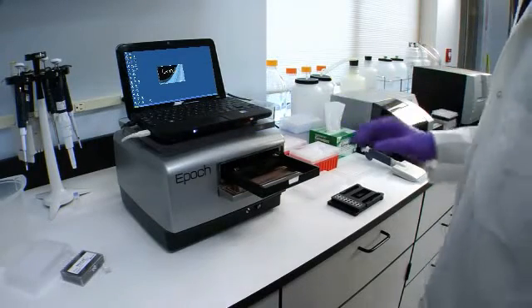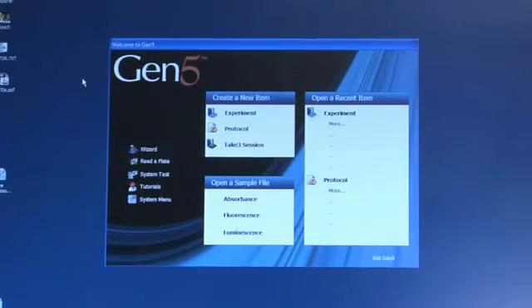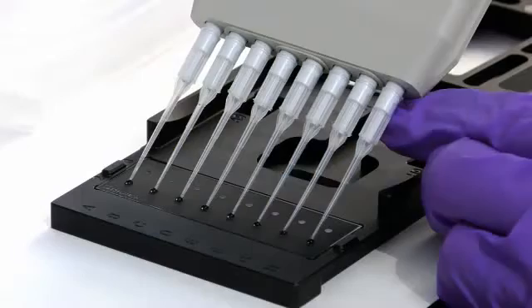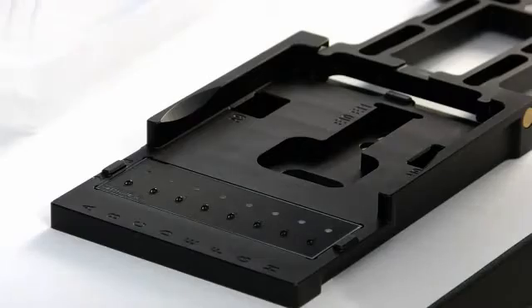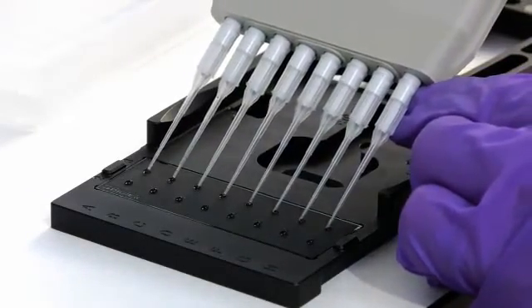Pre-programmed protocols in the Gen 5 software make it simple to choose the sample type and quickly obtain and calculate data from the Take 3 plate. We'll use an 8-channel pipetter to place our blanks and DNA samples on the Take 3 plate.